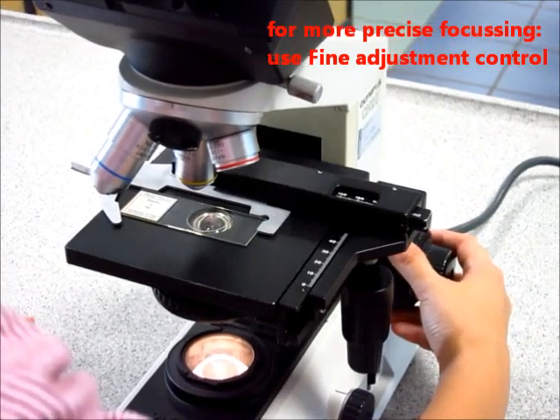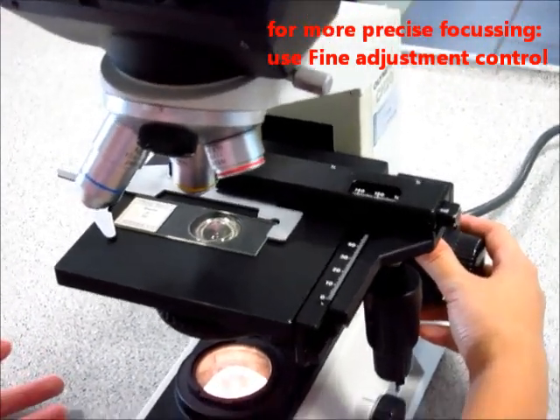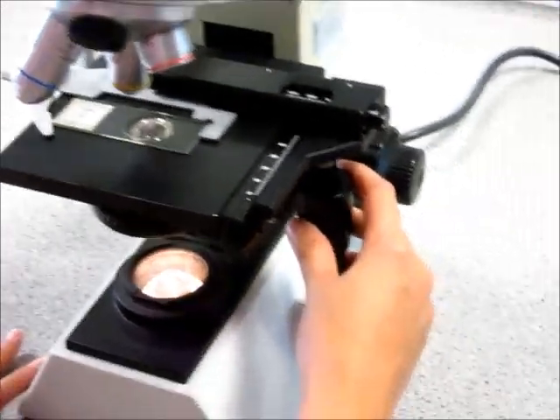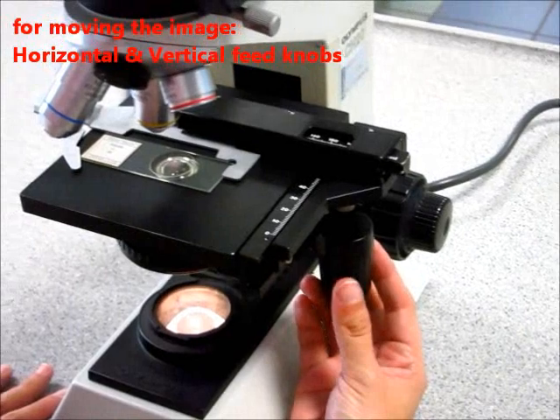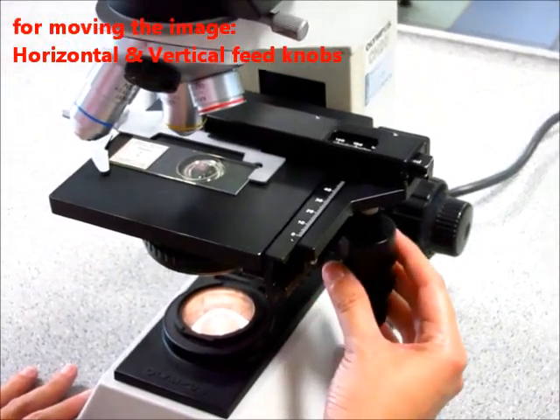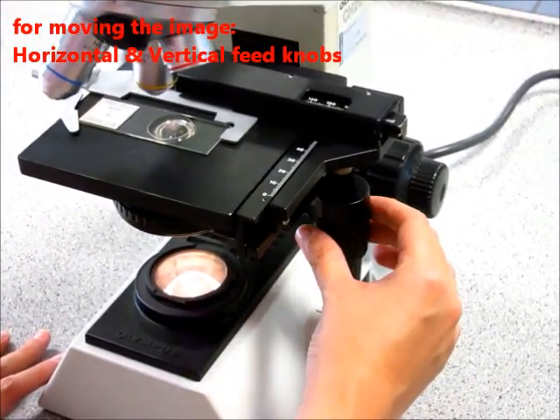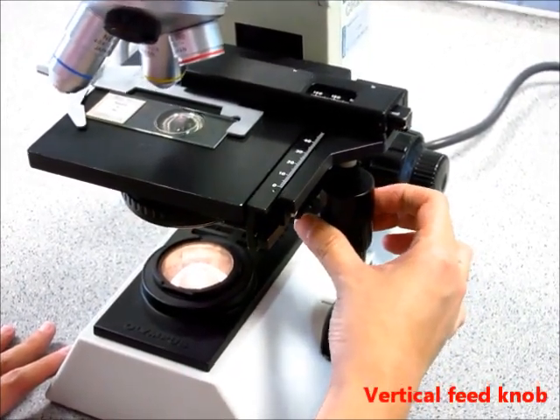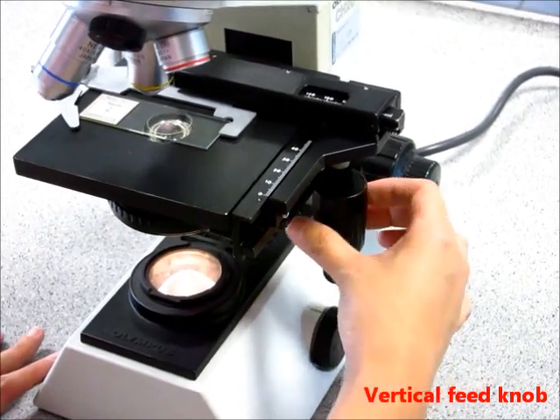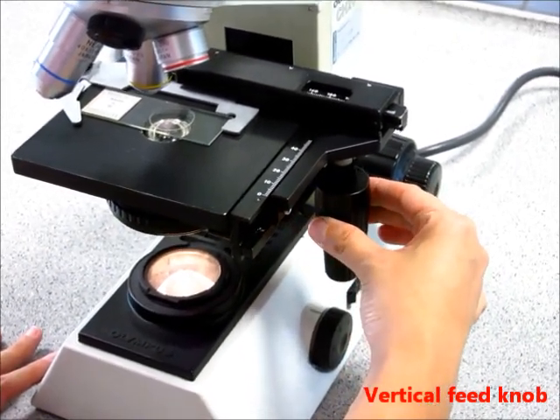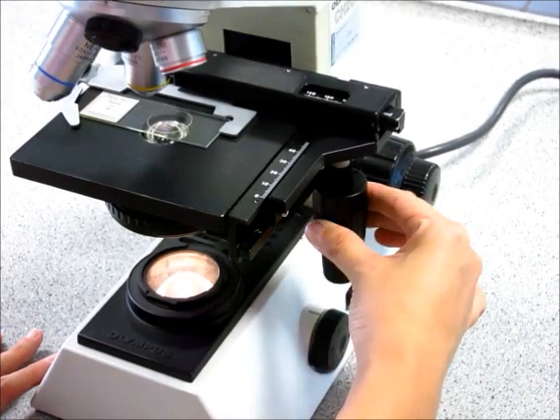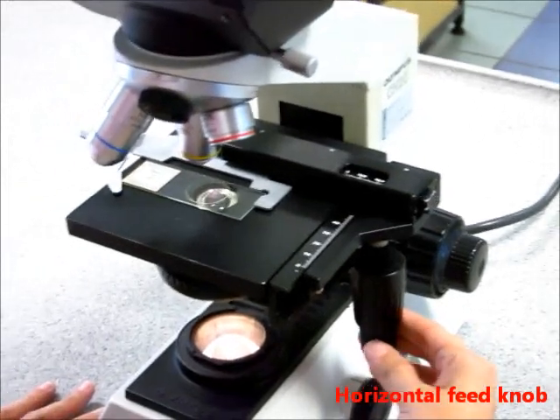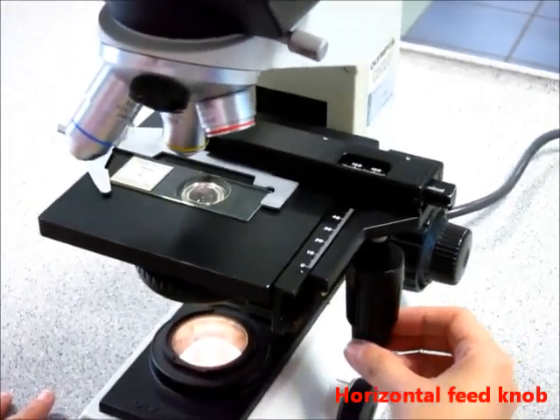So those are the knobs that you need to turn to focus the microscope. The second group of knobs that you need to turn are called the vertical and horizontal feed knob. Now they are on this side, just below the stage. The larger knob is the vertical feed knob. You can see that it causes the specimen holder with the slide to move up and down vertically. And then you have the horizontal feed knob which you turn to cause the specimen to move horizontally.